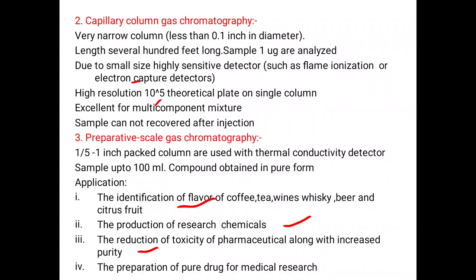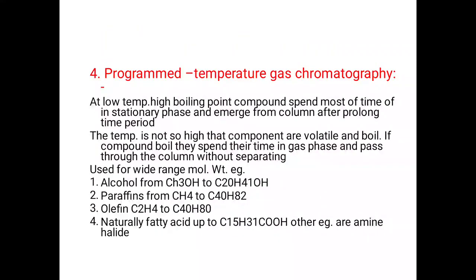Then the last application is the preparation of pure drug for medical research. This is the most important application: preparation of the pure drug for medical research, that is preparative scale chromatography. And the last type of chromatography is program temperature gas chromatography.